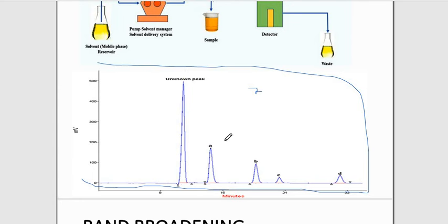So if you are dealing with, let's say, a normal phase HPLC, where we have a highly polar silica gel, the analyte with the highest retention time is going to be the most polar because it is going to be retained long in that particular column. In other words, the one with the least retention time will have the least polarity among the sample. But if you are dealing with a reverse phase, then the process is reversed. For a polar stationary phase, the analyte with the highest retention time is the most polar. With a non-polar stationary phase like the reverse one, where we have, let's say, C18, the analyte which comes out very fast tends to be the most polar, or the analyte with the smallest retention time is the most polar in the reverse phase system.